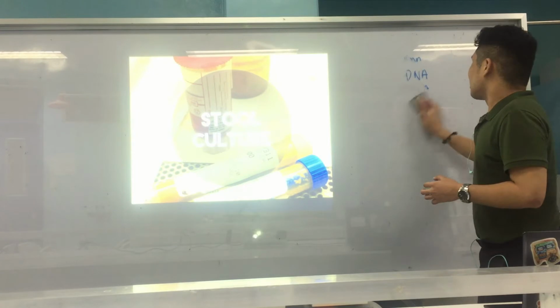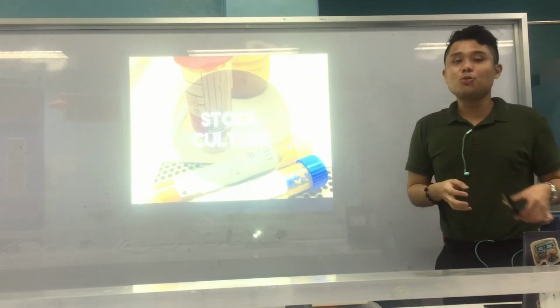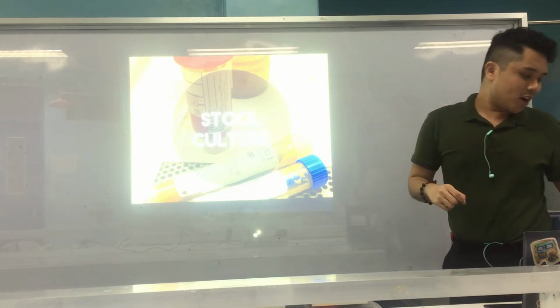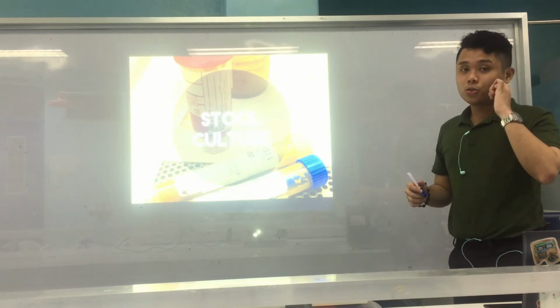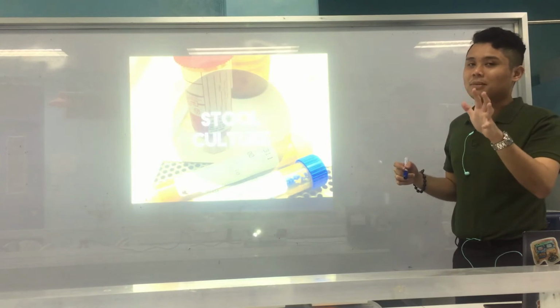This time, we're going to talk about the third specimen to process, which is stool. We have already discussed from the previous lecture the different routine culture media used for stool culture. Before we proceed, I have some additional notes.